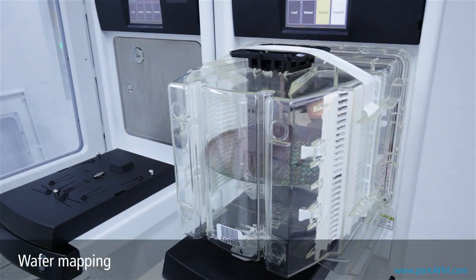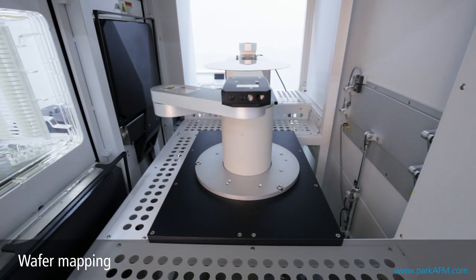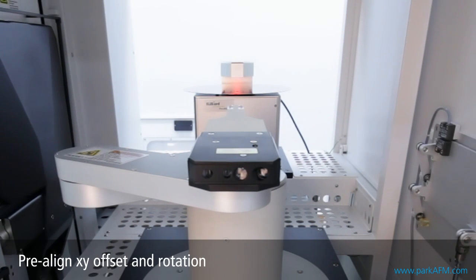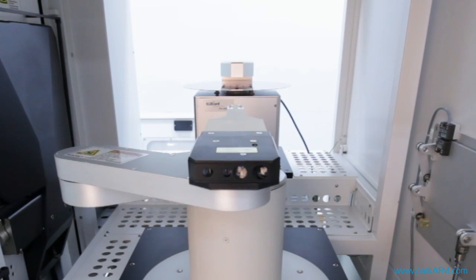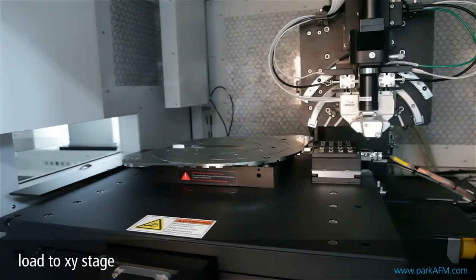In the 300mm equipment front end module, a wafer taken from the front opening unified pod is automatically mapped, then aligned for XY offset and rotation error through a pre-aligner. The aligned wafer loads automatically onto the XY stage of the AFM system.